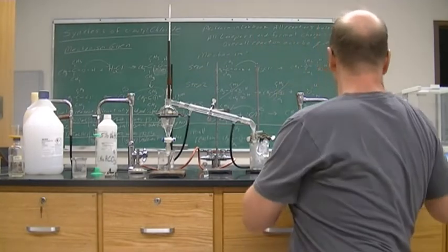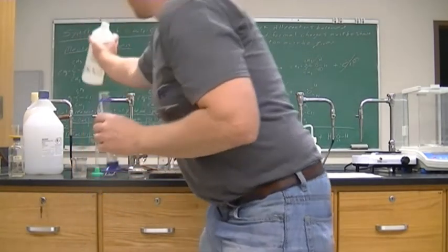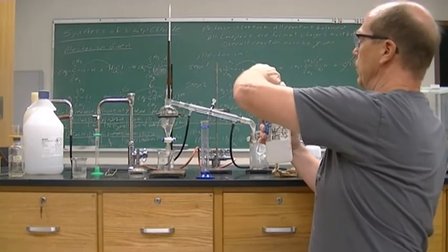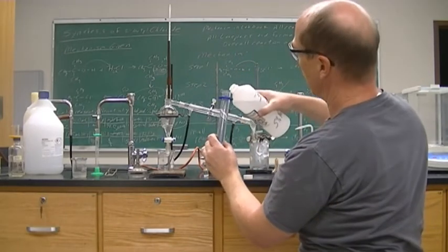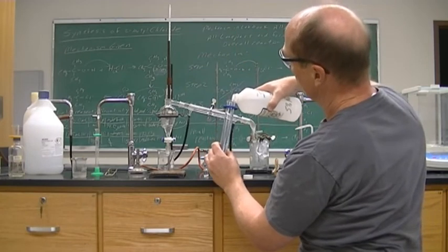So the next time we're going to use 5% sodium bicarbonate, so it's just baking soda, 5 grams of the solid baking soda into 100 mils of water, mixed up. That is how you make a 5% sodium bicarbonate.